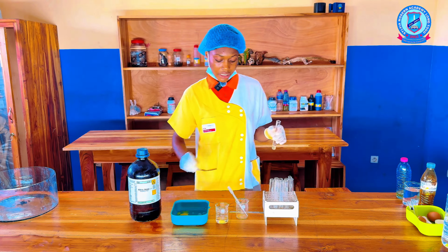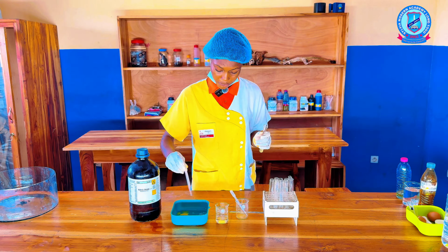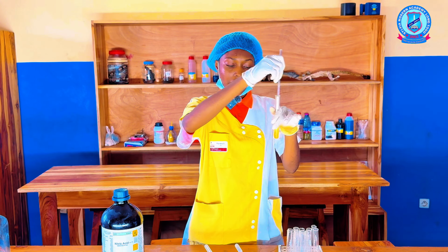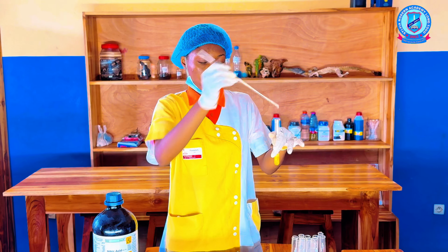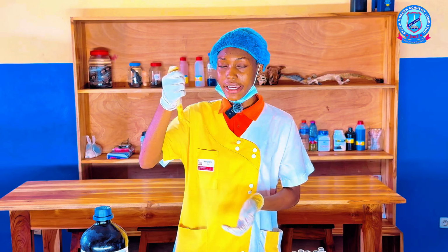So next, we are going to add our nitric acid into the test tube to check for the protein. So as you can see in the test tube, after adding a nice amount of the nitric acid into our food sample, we can see that it turned yellow and also formed a solid, which shows that there is presence of protein in the egg.